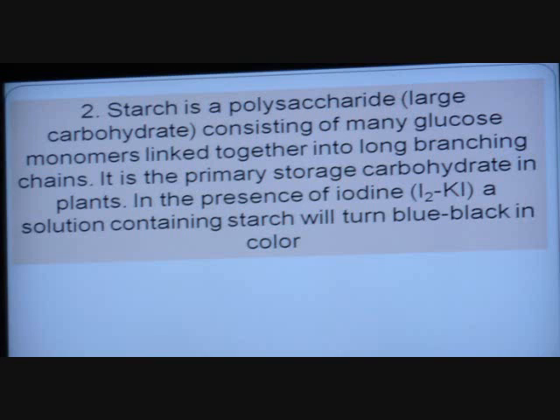And I've got a few pictures to show you of the actual positive reaction. Now, the iodine I remember using is kind of a light strawy brown color. It's not black like you're going to see. I hope that iodine over there is a straw brown color that will turn black. All right, and move on.